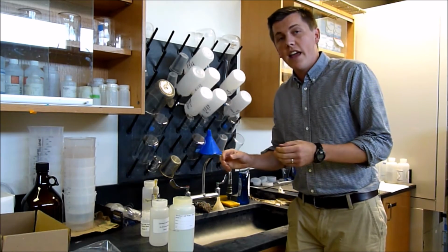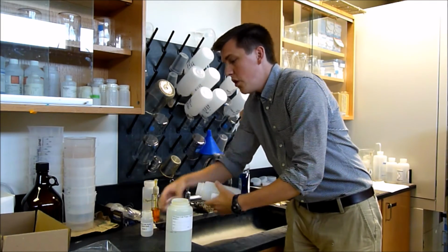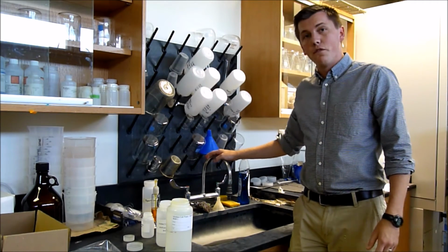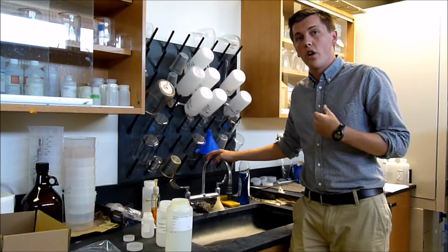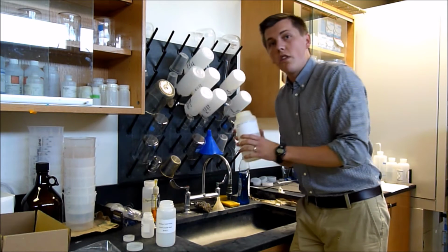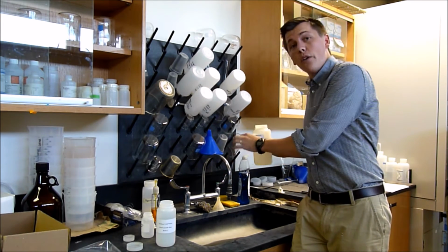So you can go ahead and remove all 3 caps from your sampling bottles. And when you go to sample, it's really important that you sample at full flow from your kitchen sink, as if you were filling up a pitcher of water. You'll start with the largest bottle first, and you'll collect the full first liter that comes out of your tap.